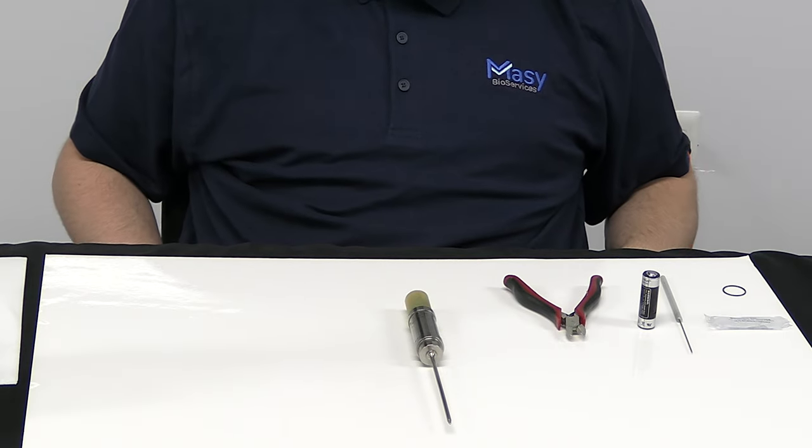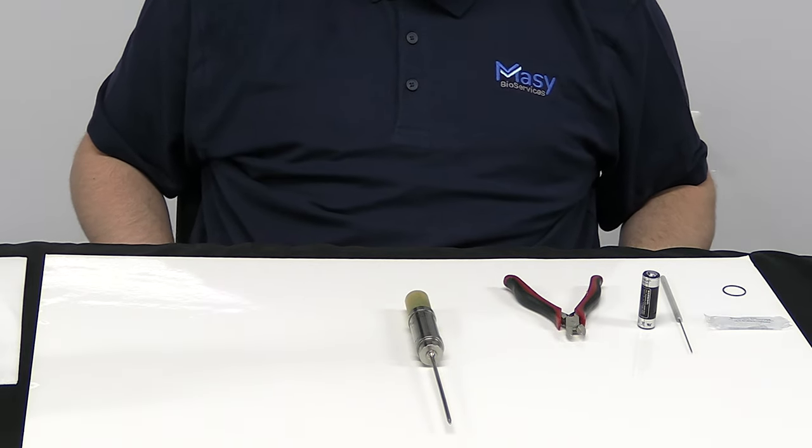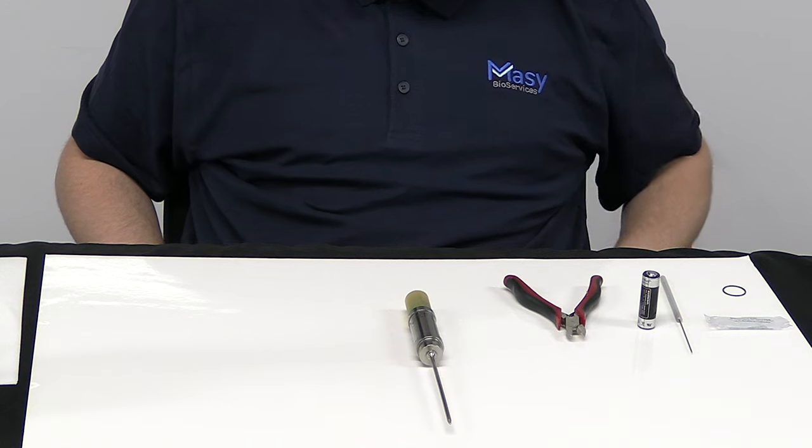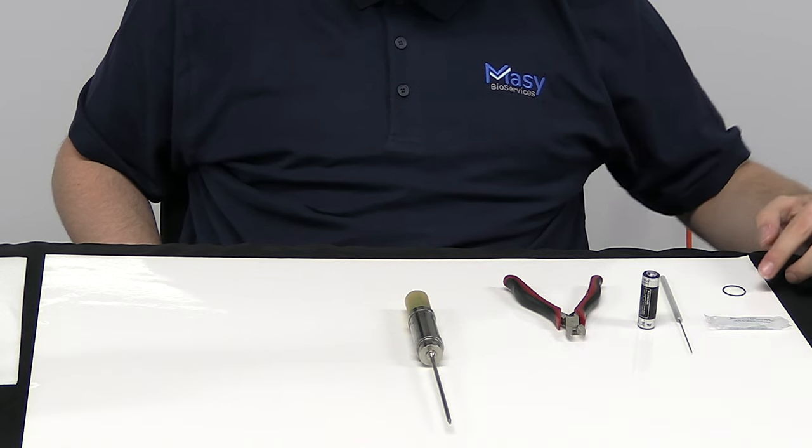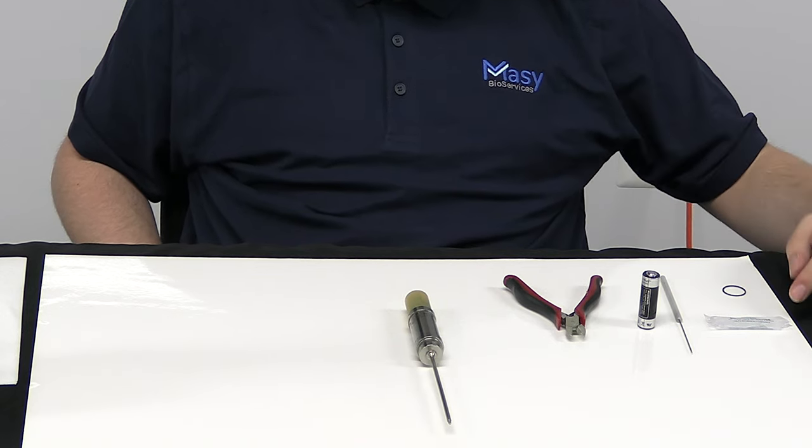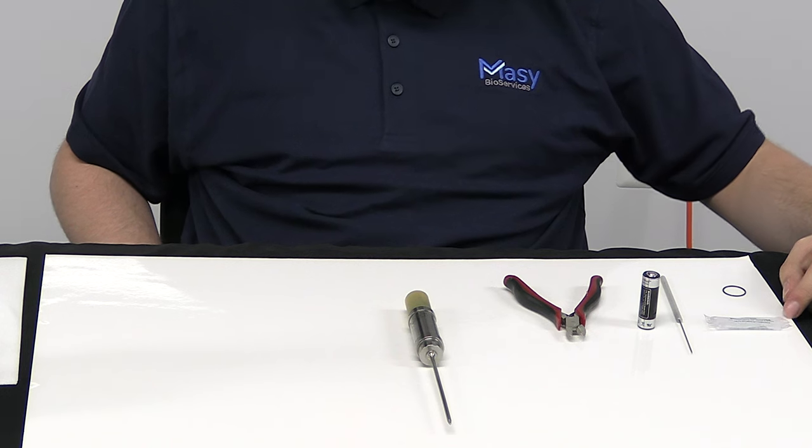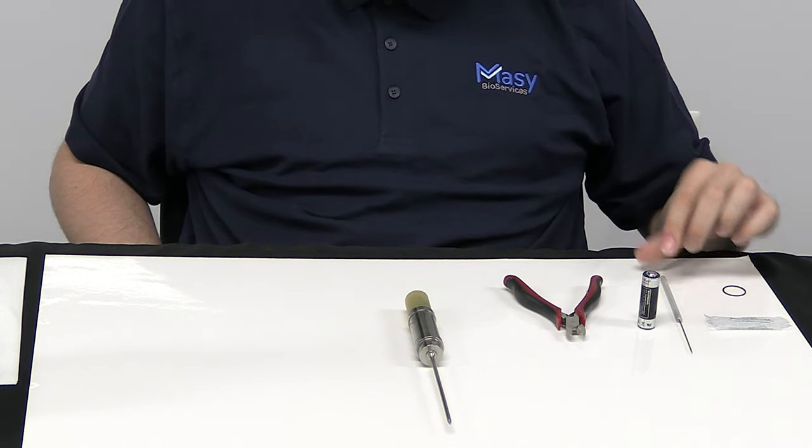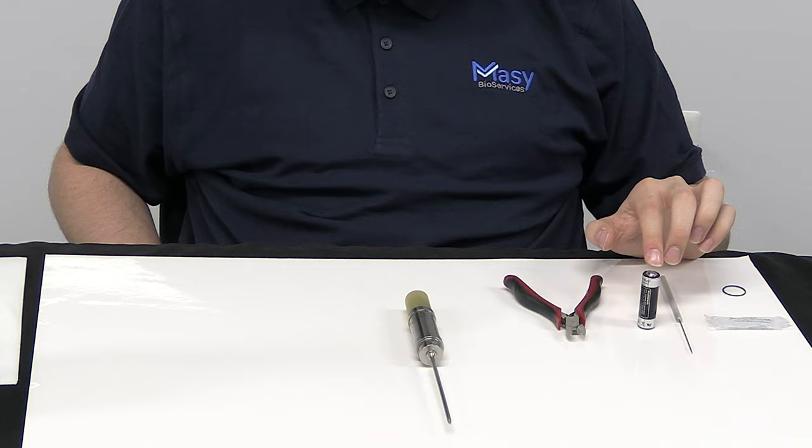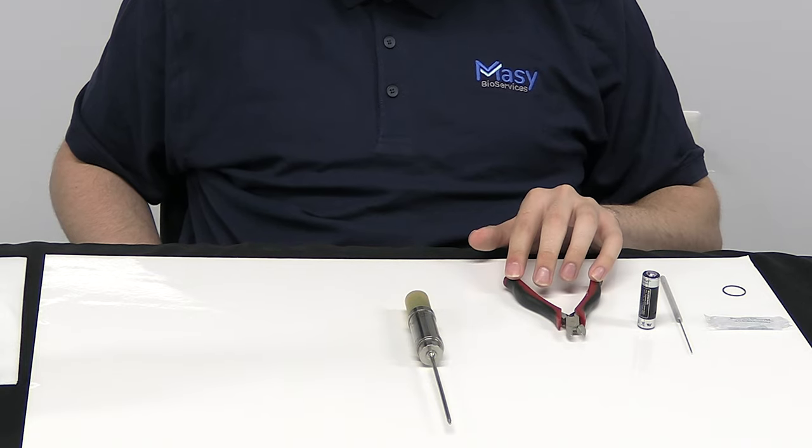Hello, today I'm going to be showing you how to replace the battery on an MPRF data trace unit. The tools we're going to need are a replacement rubber o-ring, a silicone grease packet, a metal pick, a new replacement battery, and a pair of metal clippers.